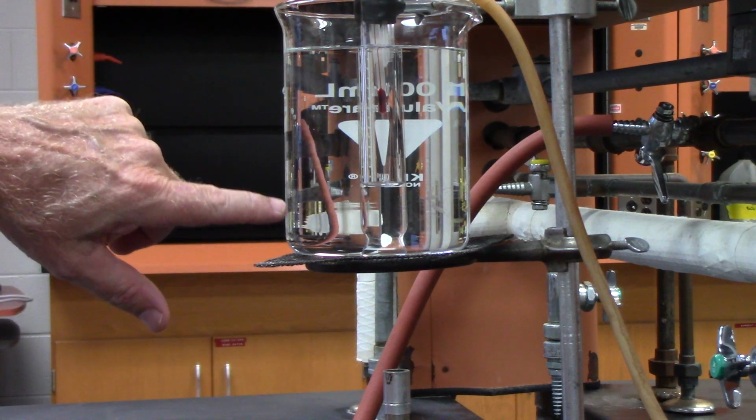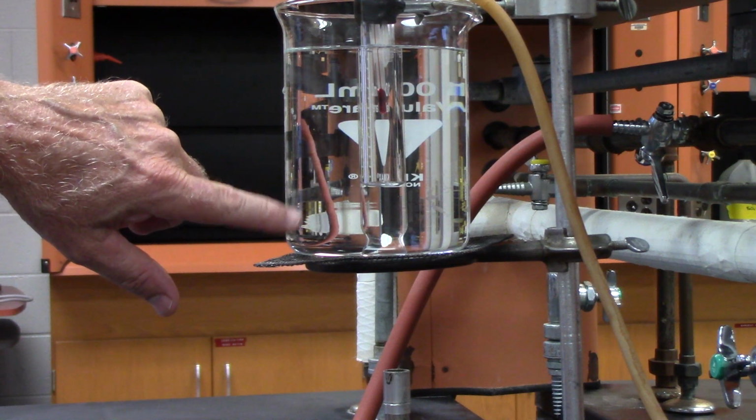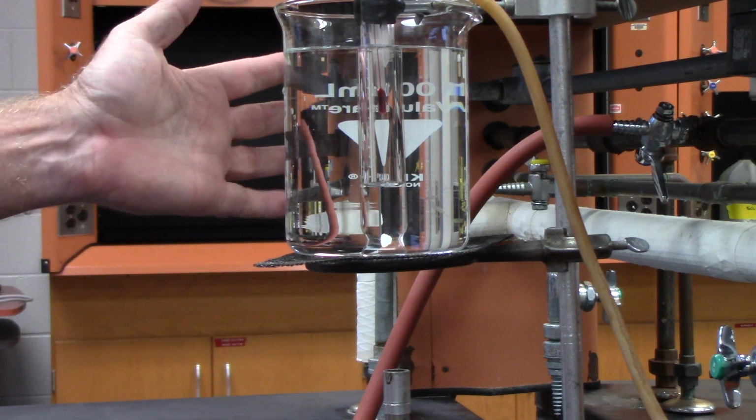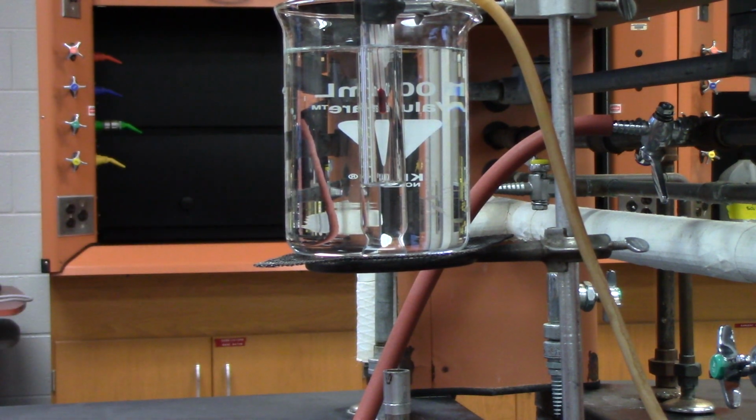And as it happens, you'll see bubbles forming on the beaker. Eventually you'll start seeing bubbles forming inside the unknown, and it'll look like maybe it's starting to boil. What you know is boiling. Okay. Boiling is more than just getting to a certain temperature and bubbling. Okay.